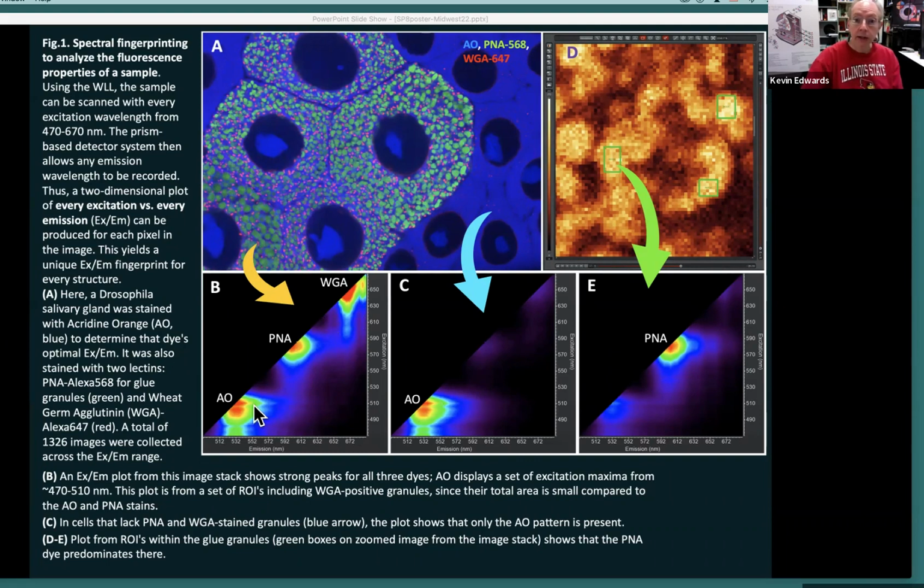Well, here we see that the structure of the fluorescence looks quite different than the Alexa dyes. Acridine orange has multiple peaks of excitation. However, all of its emissions are in the green range. Well, so what about the orange component? Well, it should be out here, but it seems to be absent from this experiment.